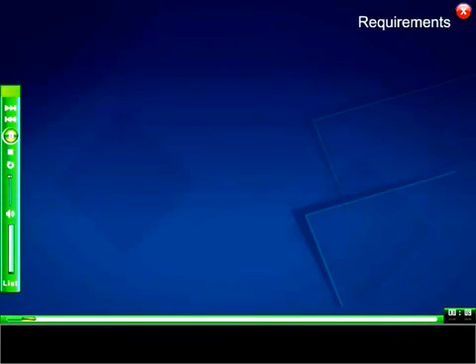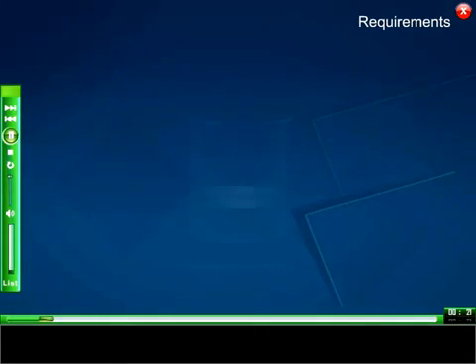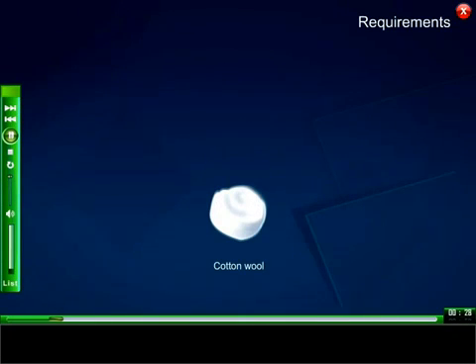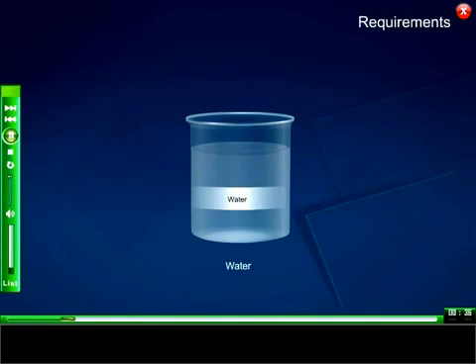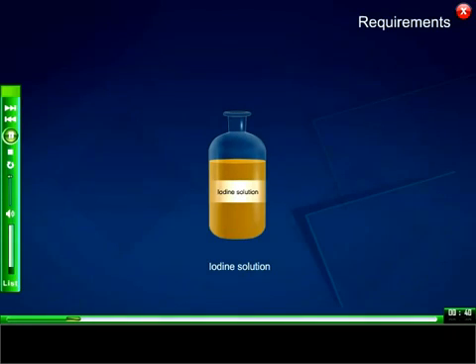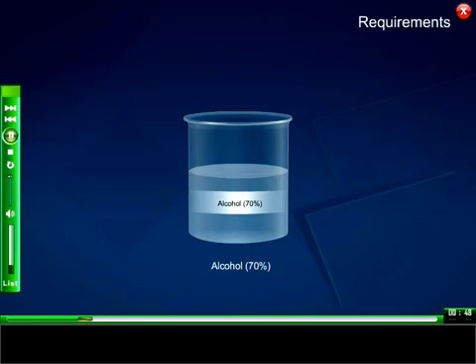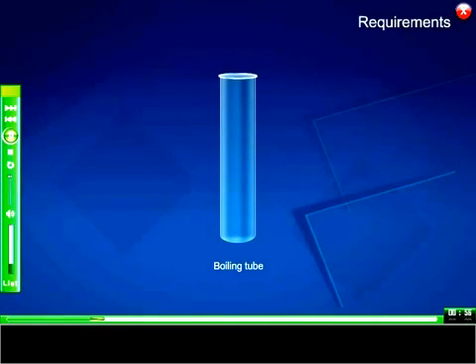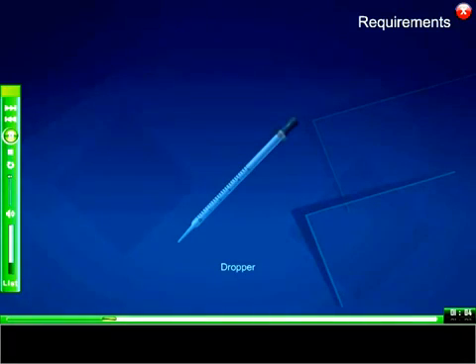Requirements: potted plant, conical flask, clamp stands, sodium hydroxide solution, cotton wool, lime water, water, iodine solution, beaker, alcohol 70%, Bunsen burner, boiling tube, watch glass, forceps, dropper.